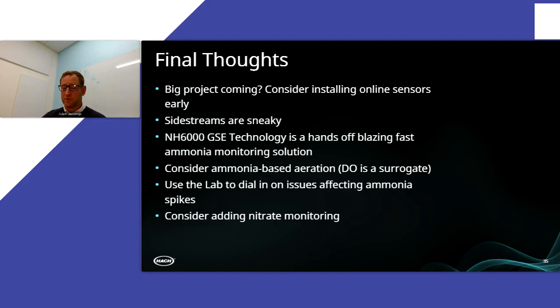You can use these ammonia monitoring systems in post-aeration systems, post-aeration banks, effluent, and when you start seeing some issues in these separate systems, you can go back into the process with grab sampling and figure out where some of these problems are happening. It's a really nice way to start getting into problems before they become a real issue for us.